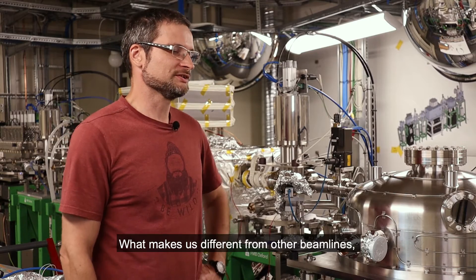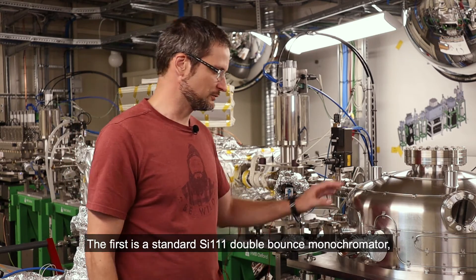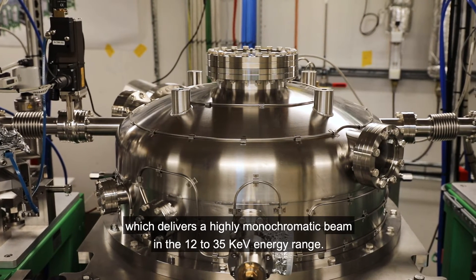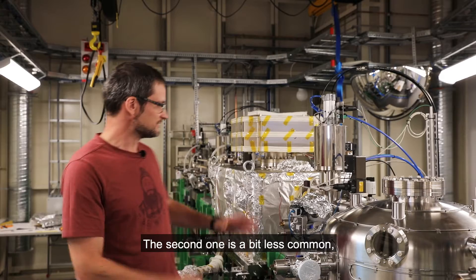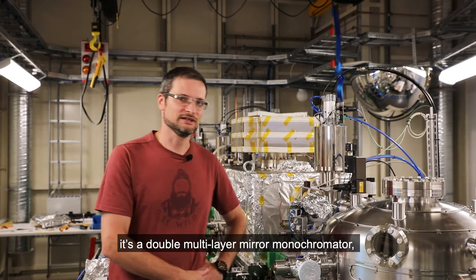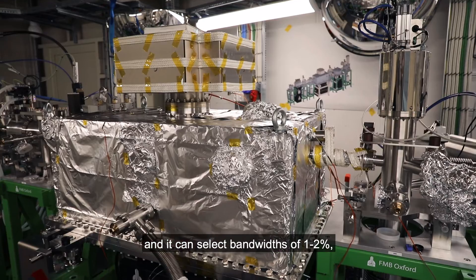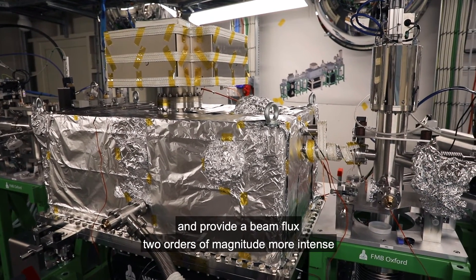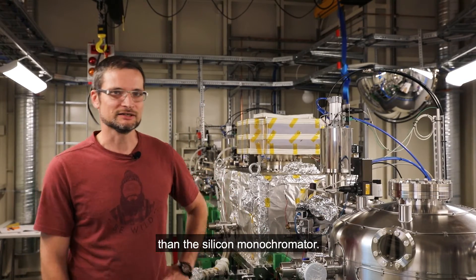What makes us different from the other beamlines is the fact that we have two different monochromators. The first is a standard silicon 111 double bounce monochromator, which delivers a highly monochromatic beam in the 12 to 35 keV energy range. The second one is a bit less common — it's a double multilayer mirror monochromator, and it can select a bandwidth of 1 to 2% and provide a beam flux two orders of magnitude more intense than the silicon monochromator.